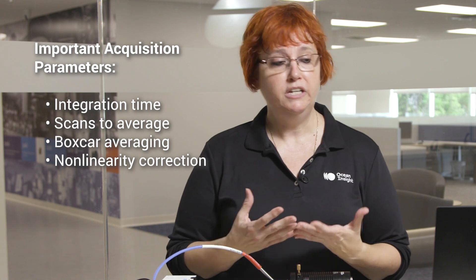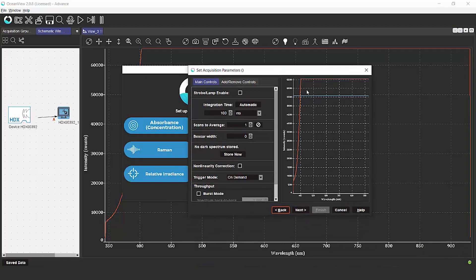The first thing that you're going to need to do is adjust your integration time. At 100 milliseconds, which is the default setting in the software, we are completely saturating the spectrometer.